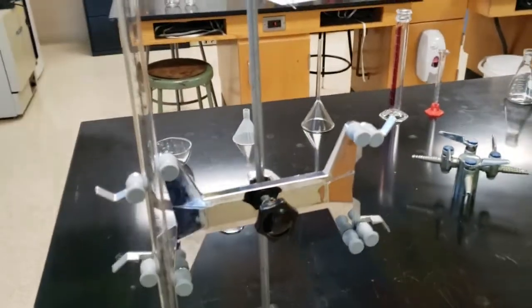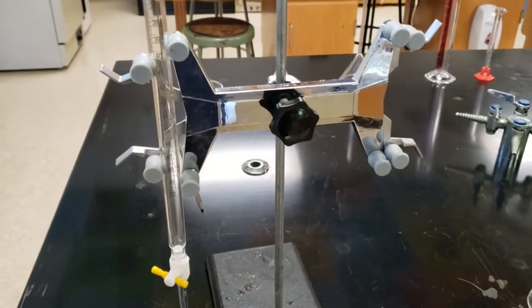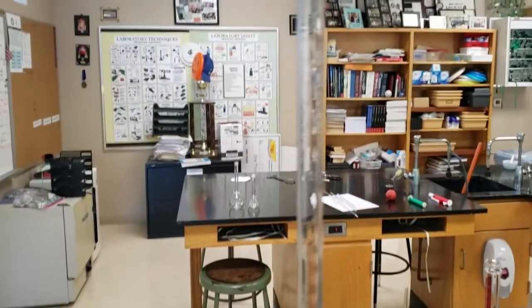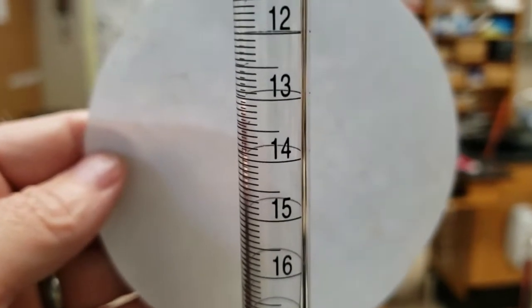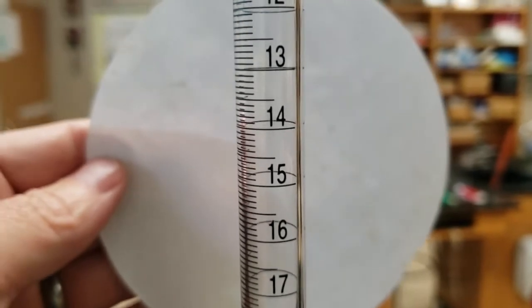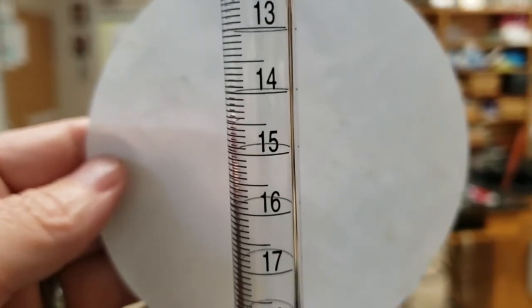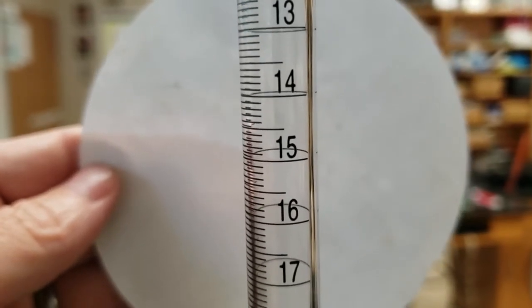This is a ring stand with a burette clamp and a burette, not a beret, a burette. If you look closely, they actually measure upside down. So here we can see the 17s on the bottom, the 12s on the top. So if it's just above the 14, it's actually 13 something, not 14 something. That's something kind of unique to this.